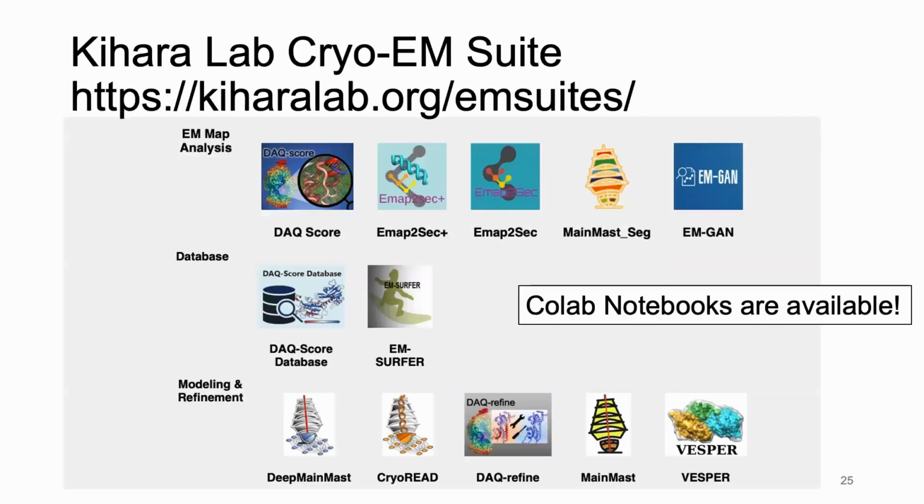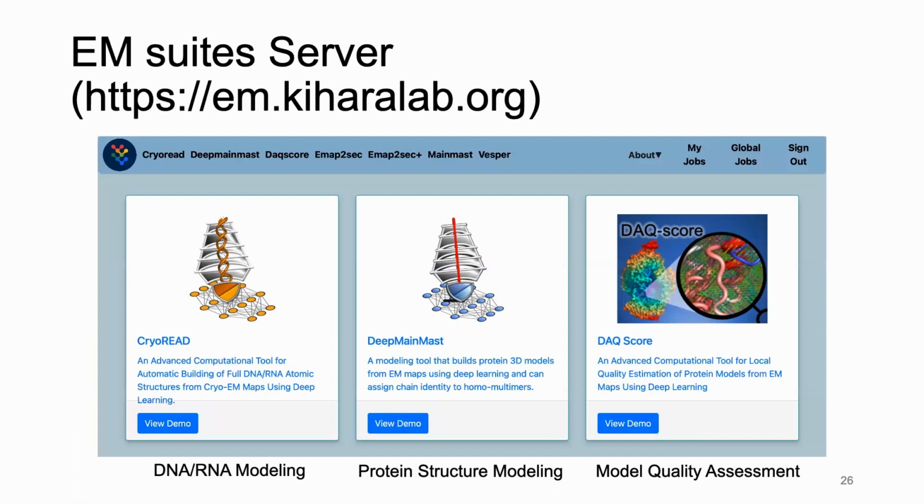Okay, now we can demonstrate the software. All programs are available in the Kihara EM suite or server.